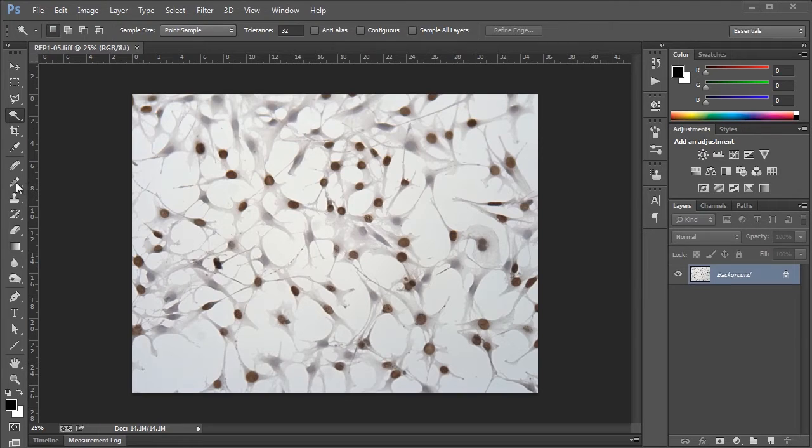Now when I actually did this experiment a number of years ago, I remember sitting in my office clicking through each cell and counting in my head one at a time like a real noob, and it took forever, especially when I had to go through hundreds of these images. So I was really happy to develop this technique, albeit many years later, because it can take the analysis of your image down to maybe a minute or even less than that, and should let you plow through your data pretty quickly.